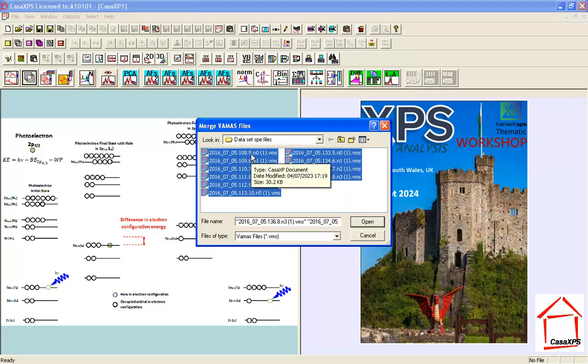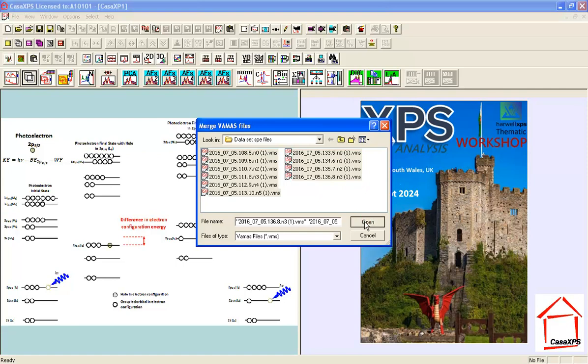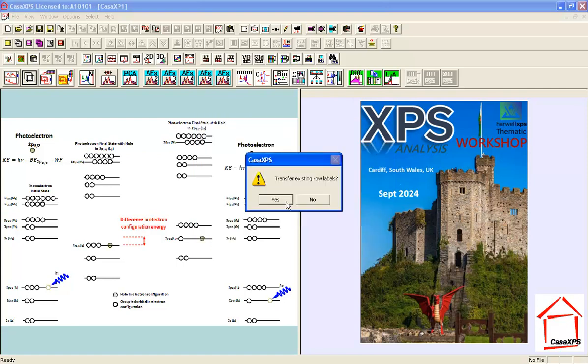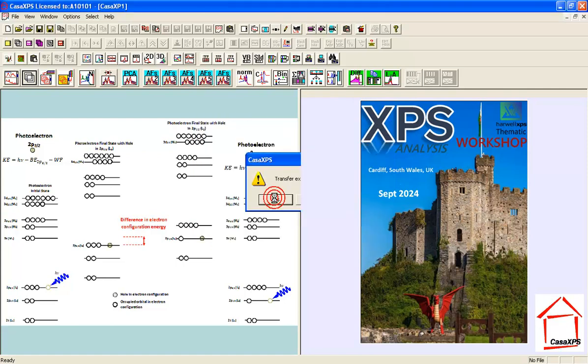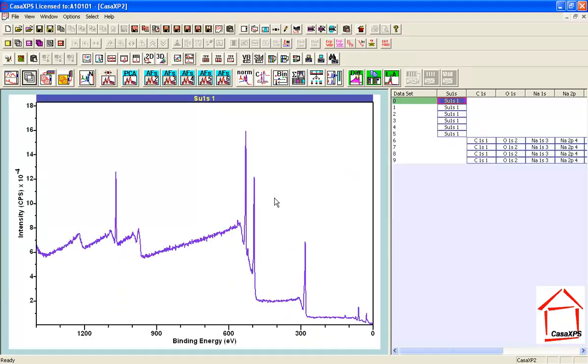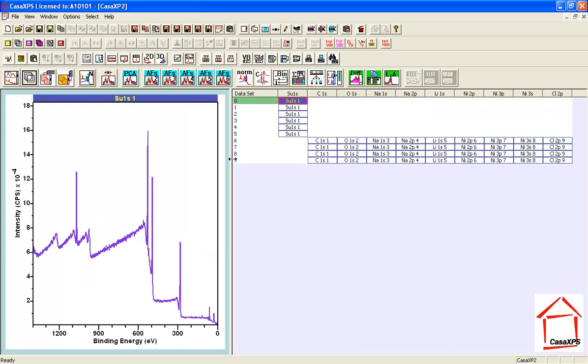...in terms of survey and high-resolution data, are in separate files. So when I open and merge these data, I end up with a VAMAS file that does not show the correct relationship between the survey measurements and the high-resolution data.